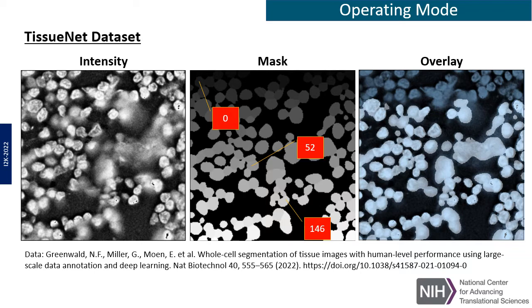Non-informative background is black. This is a typical setup from the data perspective. We always work with a pair of intensity and segmentation mask images. Some segments lay nicely in a frame while some do so partially. Obviously, they continue on the mosaic tiles.